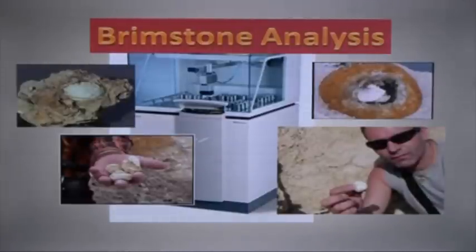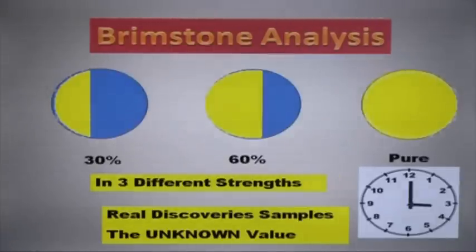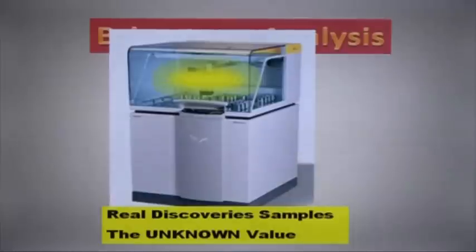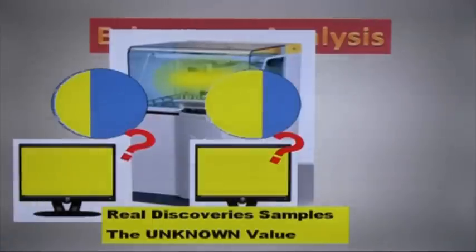We are now going to do the same thing again, but using the real discovery samples, which are the unknown value. So once again, a 30%, a 60% and a pure sample are prepared. That takes us another 2 hours. We subject them to the machine's analysis. It looks at the 30% sample, but something's not right. The reading goes off the scale. It's saying, I'm seeing a lot more than 30%. It looks at the 60% sample, and again, the reading is off the register.